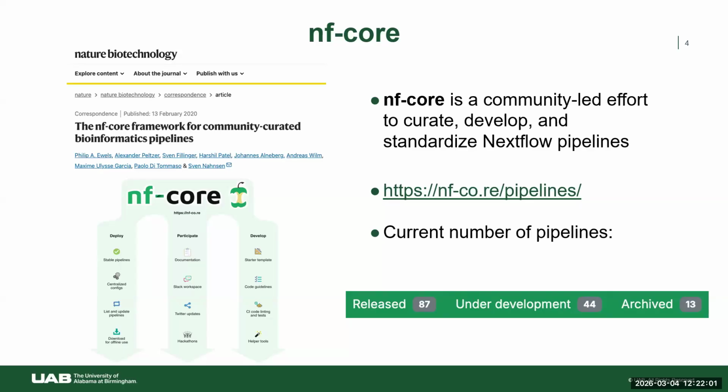NF-Core is about the community. What they have really done by working with community members is to standardize and ensure that FAIR practices, reproducible practices, scalable practices were in place for these types of workflows. So that includes not only standardized coding, but also standardized documentation, right? There's nothing worse than finding a great tool that is not well documented. Standardized pipelines in the context of versioning, so version-controlling workflows really well, and community outreach too.